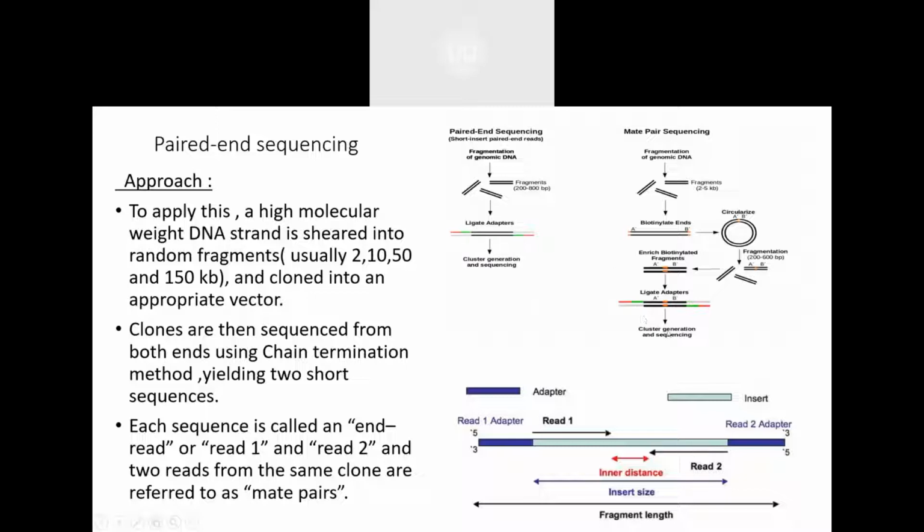Can adapters act as an amplification for fragments? Yes, it can also, because we need primers for amplifying DNA. DNA polymerase cannot itself start the amplification, it needs a primer. So adapters can act as binding sites for primers also.